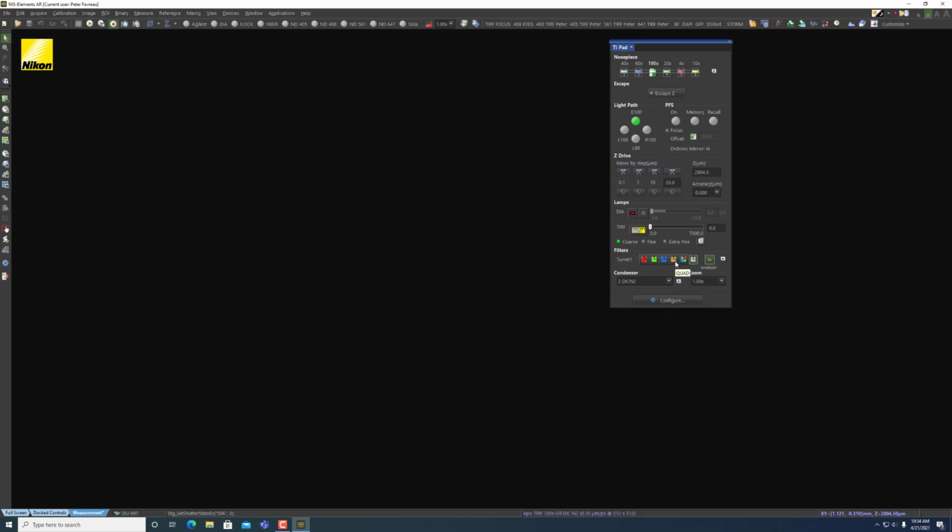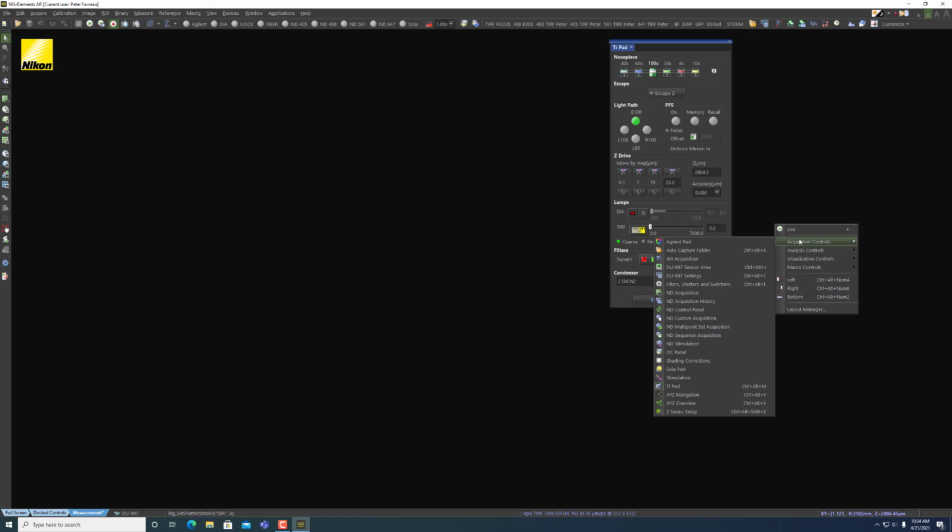We're going to talk about this in a second, but this is generally used for TIRF, and it's because it has multiple band passes, which just means it can allow in multiple wavelengths of light, not just some specific area on the visible spectrum. Similarly, this is for looking at CFP, YFP, and mCherry. But the big things we're going to look at today are going to be these three filter cubes. These are really standard, and the quad. So the next thing I'm going to talk about is our filters and all of our setup there.